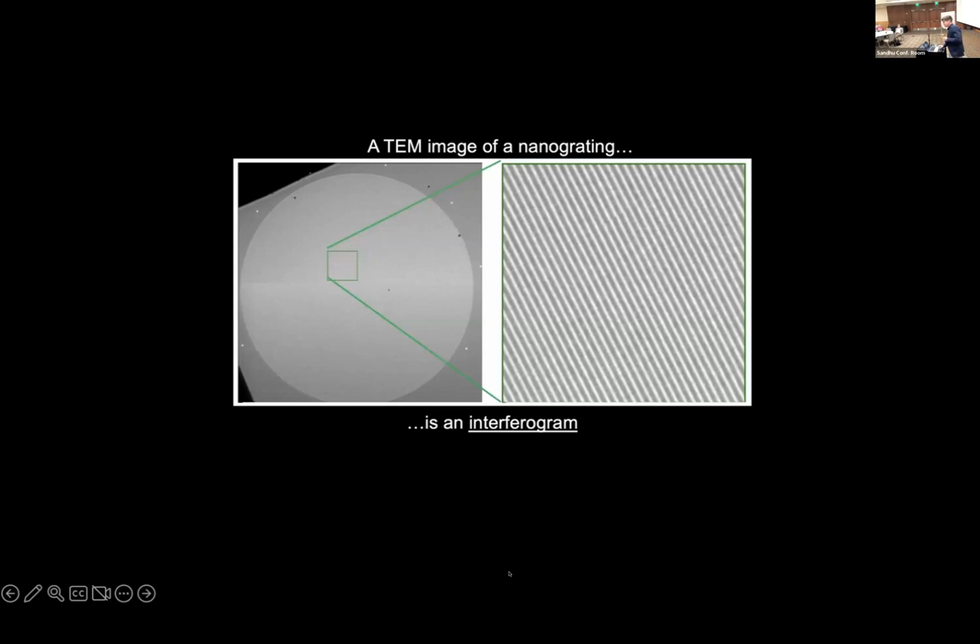Those diffraction angles are still quite small. So 2 picometers is our wavelength, and our diffraction grating spacing is on the order of 10 to the -7 meters. So our diffraction angles are microradians, so very small. However, that's what the transmission electron microscope is designed for. Every microscope, every telescope is designed to make small angles big. So we can take a small diffraction angle and still resolve diffraction.